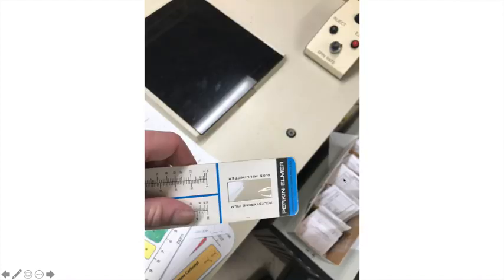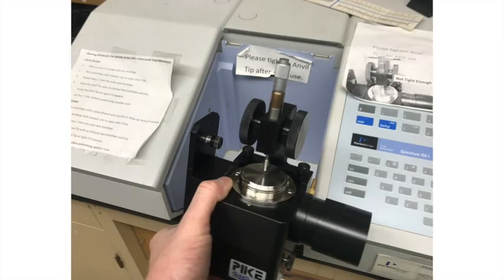So the next thing we're going to do, we have another sample that we're going to run. Look at this, the old NMR. There it is. Remember, you gotta jiggle the inject button sometimes. It's got a bad connection. So we're going to run this sample. This sample is a plastic that you see in the windows of letters. So if you ever get a letter in the mail and it has like your return address or something through there, you can read it. That's this plastic.